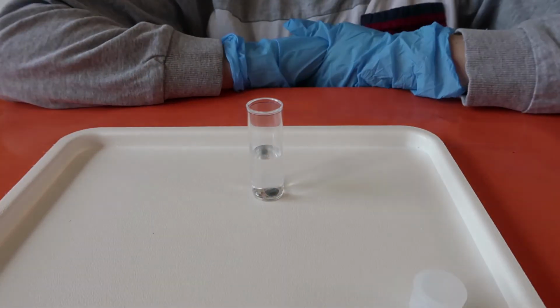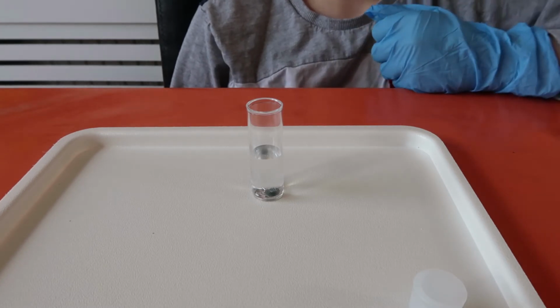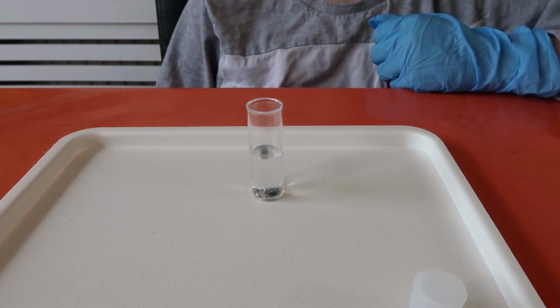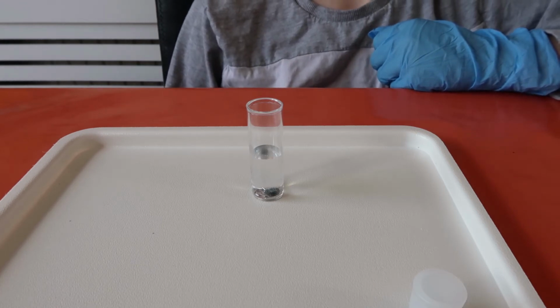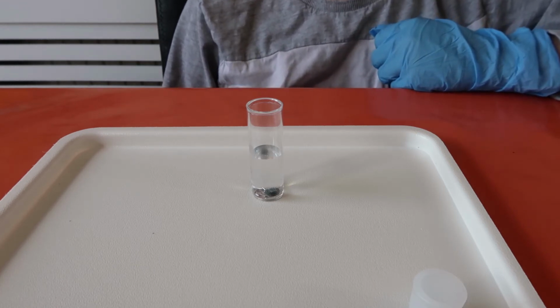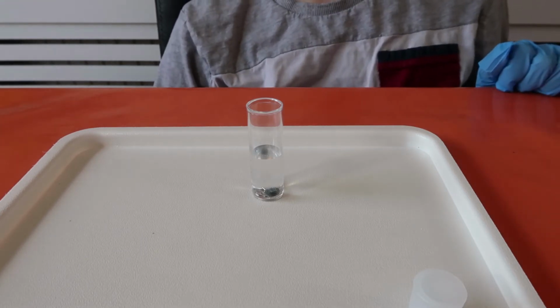And then we wait. So the zinc metal reacts with the tin chloride present in the solution. During the reaction, the tin precipitates from the solution as beautiful crystals. The tin crystals grow on the surface of the zinc pellet. That's how the tin hedgehog appears.